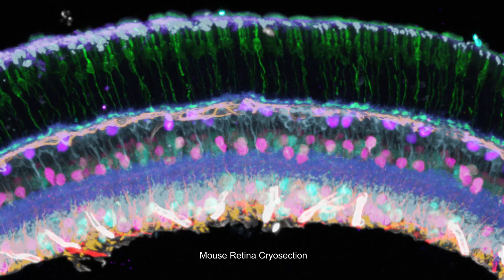In another example, the team visualized 10 protein markers in the same mouse retina cryo-section, demonstrating immuno-SABER's high multiplexing capability.